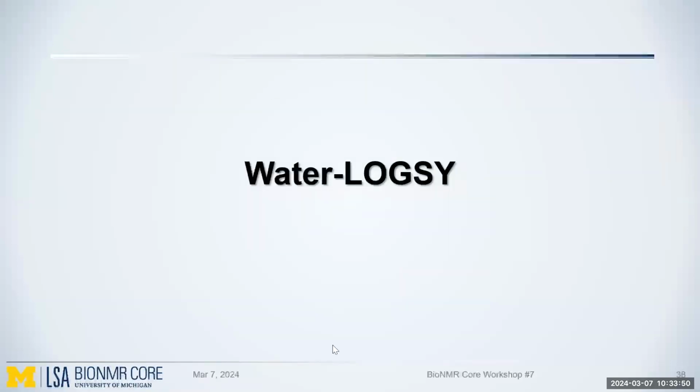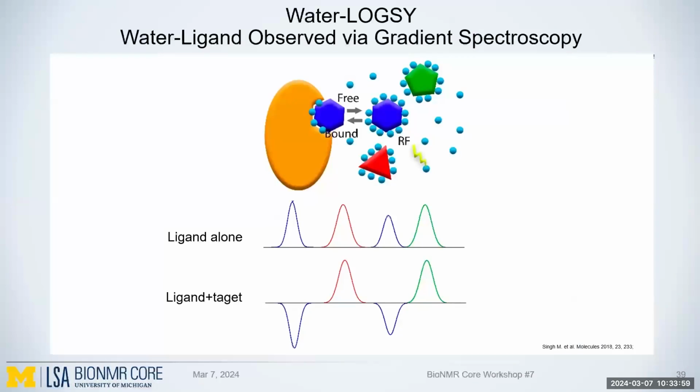All right, so then we will move on to the next method called Water-LOGSY. Water-LOGSY stands for water ligand observed via gradient spectroscopy. And this method is complementary to the STD-NMR method. So in Water-LOGSY, instead of saturating the protein resonances, we saturate the water resonances.